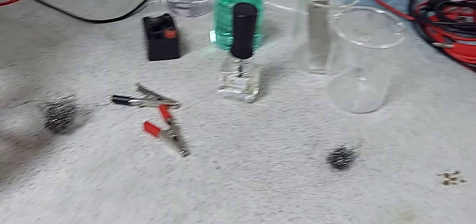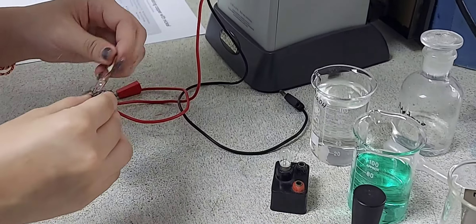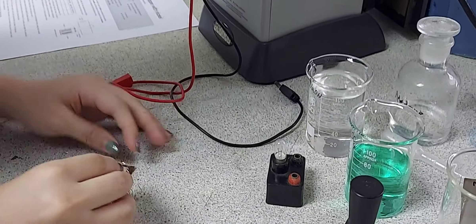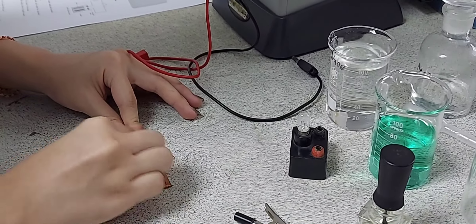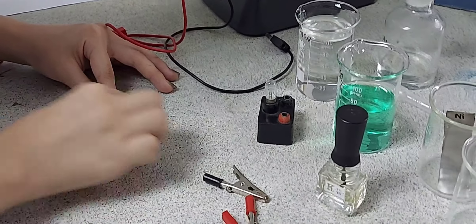Good day everyone. Today we are going to do the electroplating of copper with nickel. The aim of the experiment is to coat a sheet of copper with nickel using electricity.